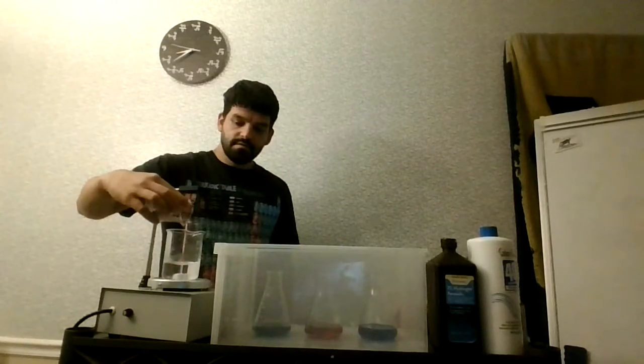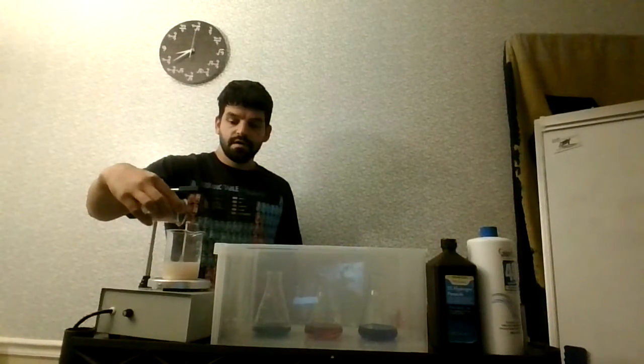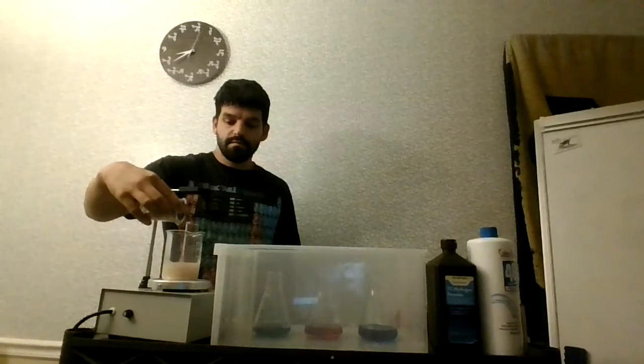So you want to terminate the addition of the yeast before it starts to get really pasty and putty-like. I'm going to keep adding here, but I did double the amount of water to keep the solution uniform.